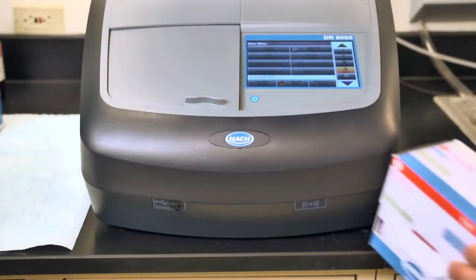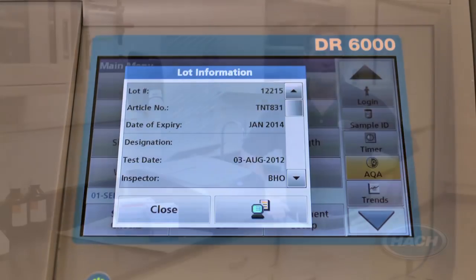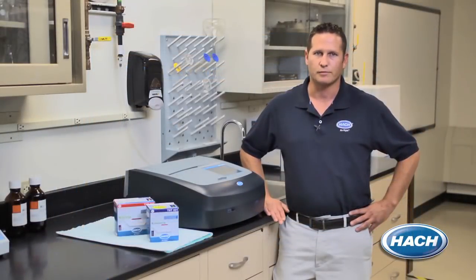The instrument's RFID technology also identifies chemistry expiration dates, helping avoid possible errors due to expired reagents while providing on-screen certificates of analysis for your quality assurance programs.